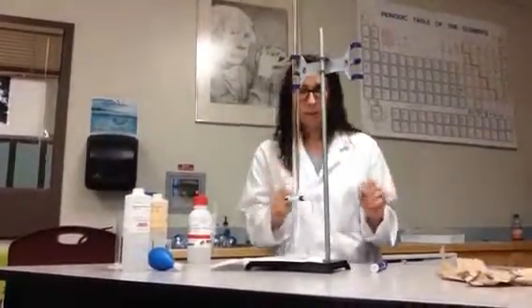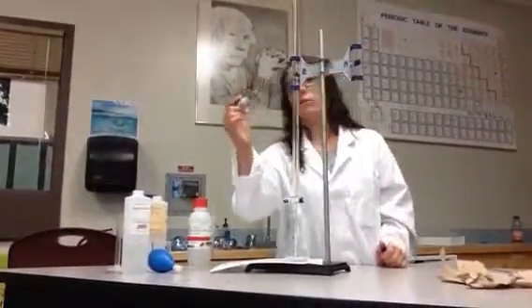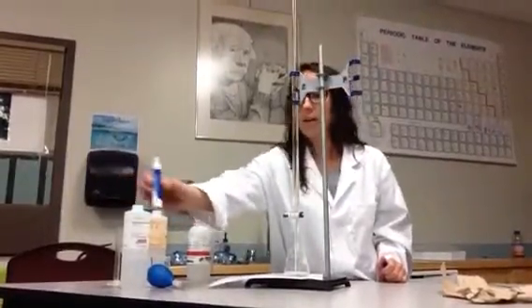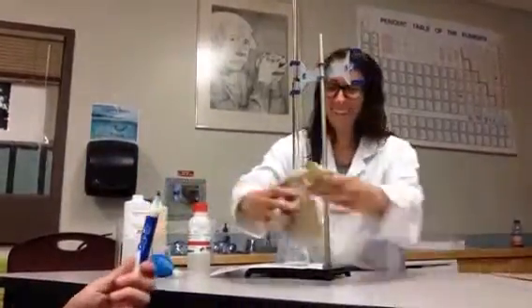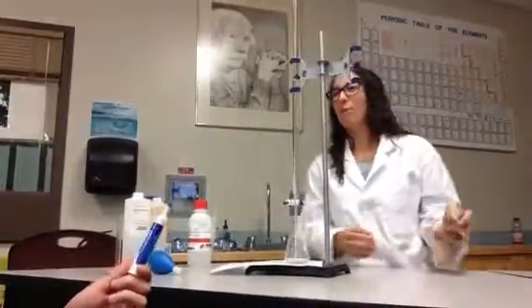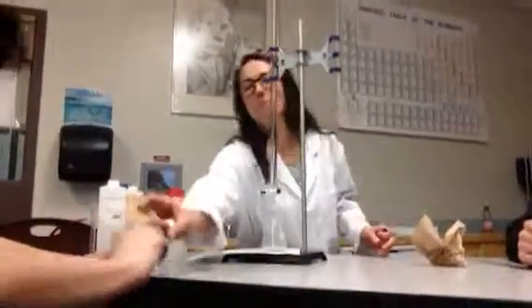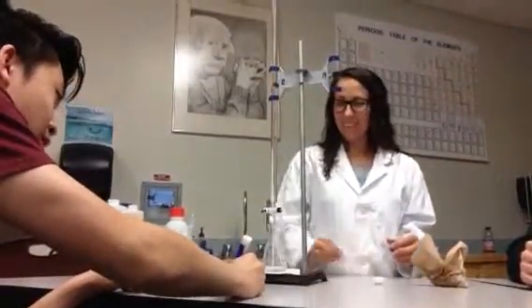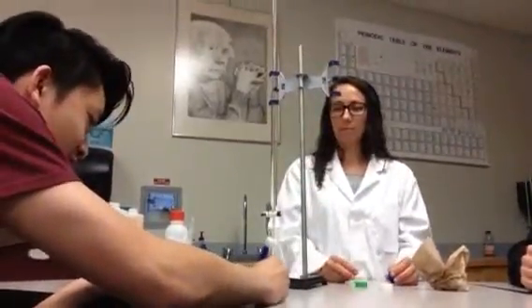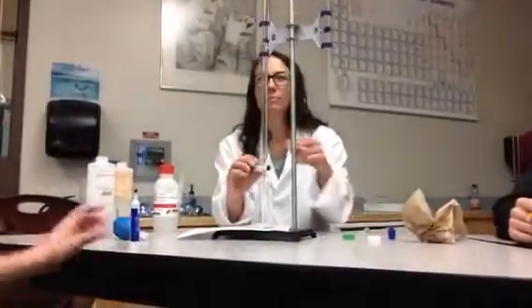Let's just pretend. So the initial volume was, oh, I don't know, let's go 46. Could you, Michael, because that's not a 4. Okay, make it a real 4 for me. 46.00. Good. Got very neat handwriting.